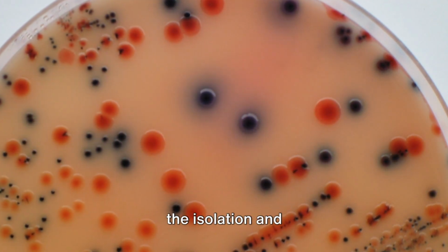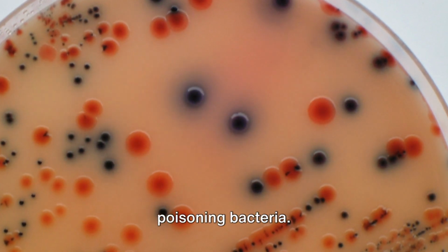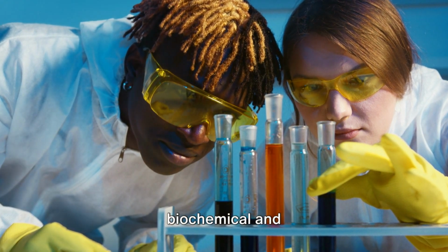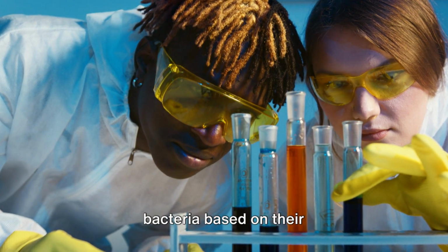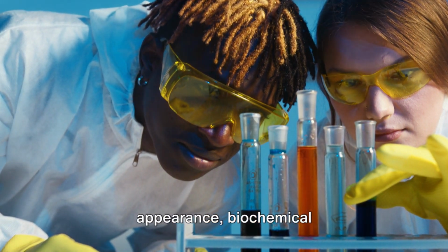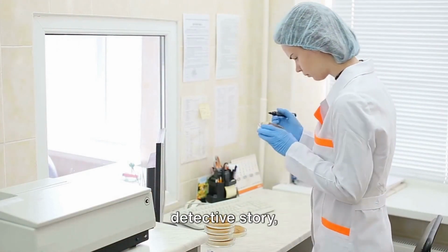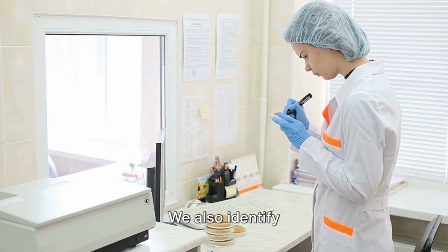Our next steps involve the isolation and identification of food spoilage and food poisoning bacteria. This is done using cultural media, biochemical, and serological techniques. These techniques allow us to categorize bacteria based on their appearance, biochemical properties, and antigenic composition. It's like an intricate detective story, solving the mystery in the world of food microbiology.